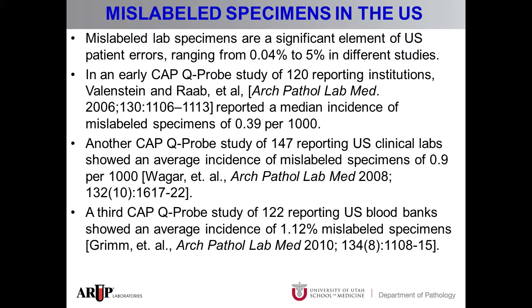Every laboratory has mislabeled specimens. At ARUP, the average rate in our specimen processing department is one mislabeled specimen per 8,000 specimens processed. This is much lower than the one per 1,000 or 2,000 that has been published based on CAP surveys. Nevertheless, we felt it important to detect and prevent every mislabeled specimen, if possible.